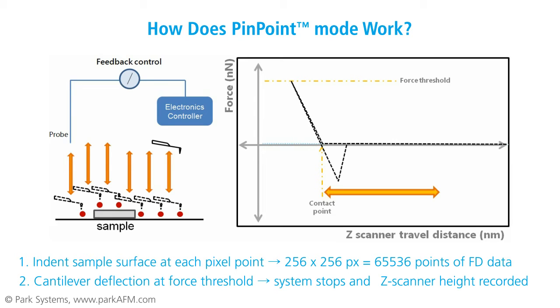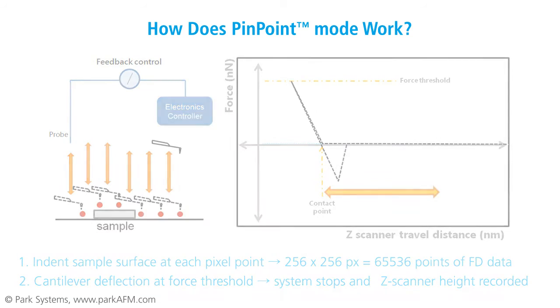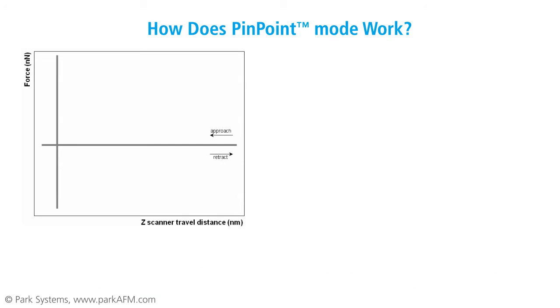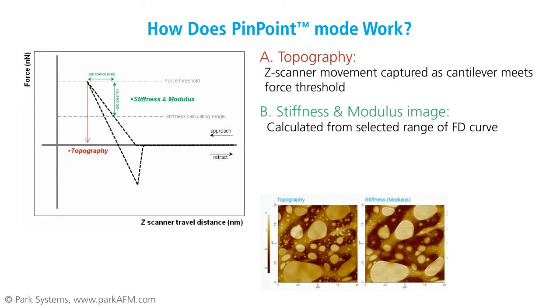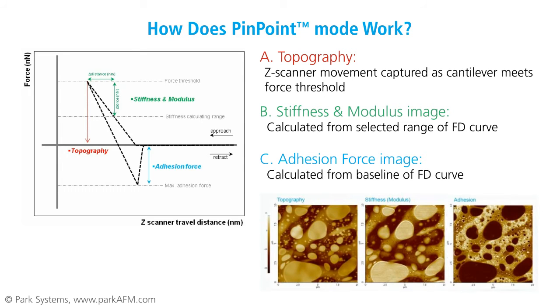In this way, Pinpoint Mode provides force distance spectroscopy data in real time while also reconstructing surface topography. Each force distance curve directly matches its corresponding position in the reconstructed topographic image. From a single data point in Pinpoint Mode, stiffness, modulus, and adhesion force can be determined by an automatic calculation process. After the topographic data is collected, stiffness and modulus can be calculated using a selected range of the force distance curve. Applying this data to the Hertz formula, the elastic modulus can be calculated. Finally, the adhesion force can be acquired after calculating the maximum from the baseline of the force distance curve.